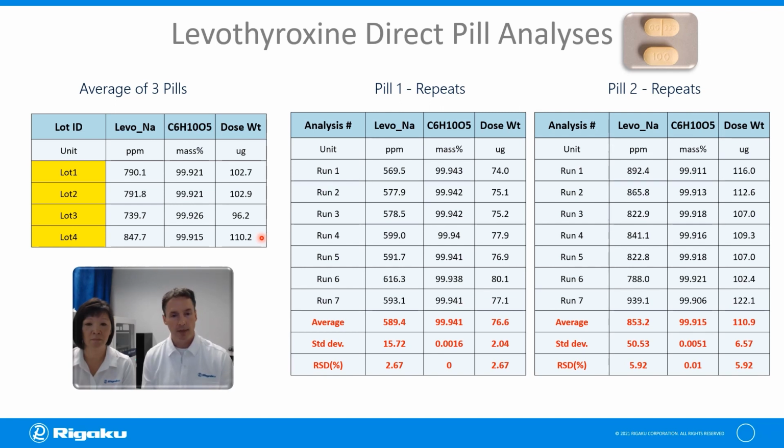Now, that may be just on three pills. If we were to look at the lots overall, we may see that they're all within spec, but these individual pills are what we're looking at, and we see some variations.